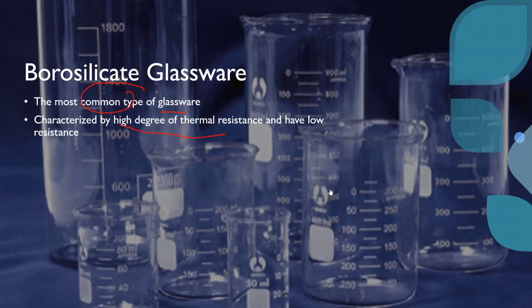However, one of its characteristics is that it can resist high temperature. The Pyrex can resist 515 degrees Celsius heat. So even though you're using your Pyrex for boiling, let's say boiling water at 100 degrees Celsius, it can take it.